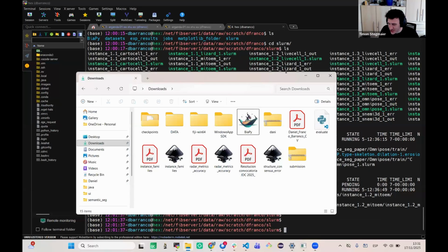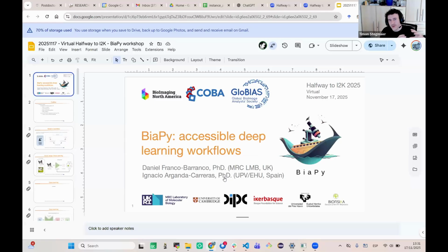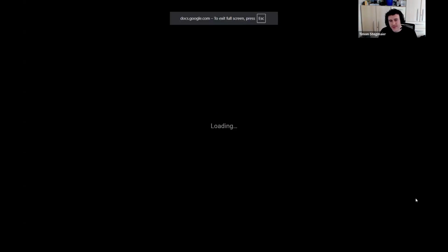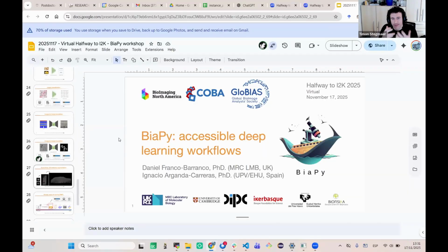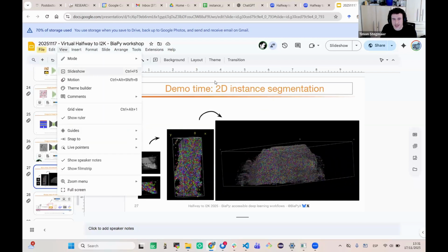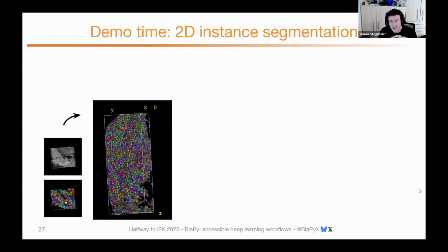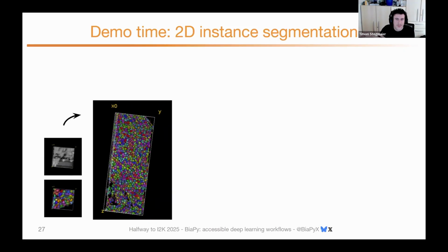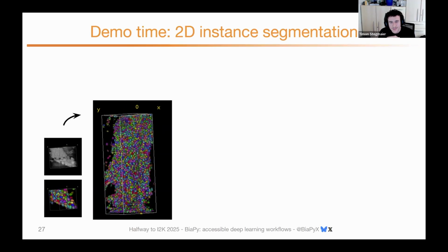And also, sorry, a second question. For this image-to-image, the example you showed is more like, you have the larger cell and then you go to nuclei. I would be interested if you, for example, have a nuclear stain and then a bright field image where, visually, you cannot say where a cell starts and ends. Could you use both together, or has something like this been done already, to predict a cell segmentation?